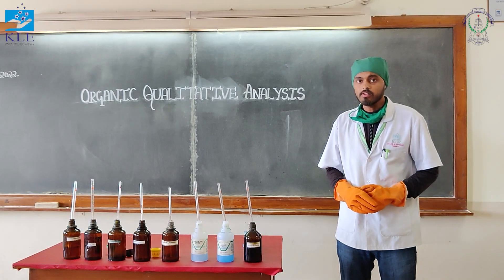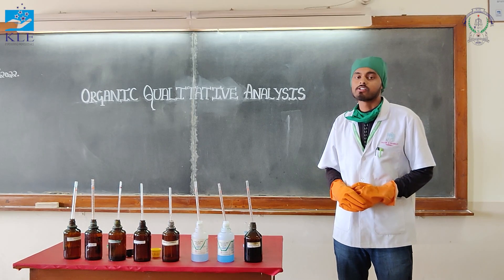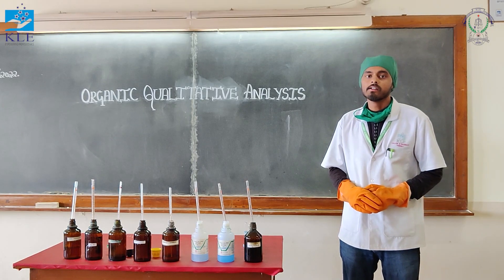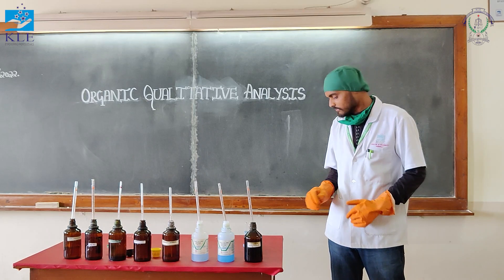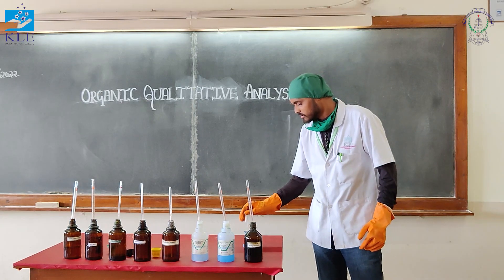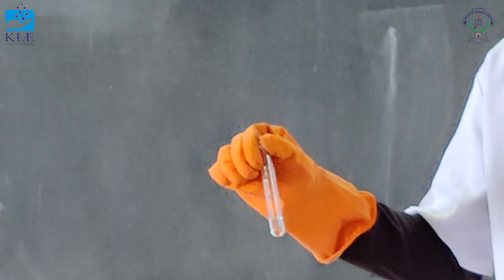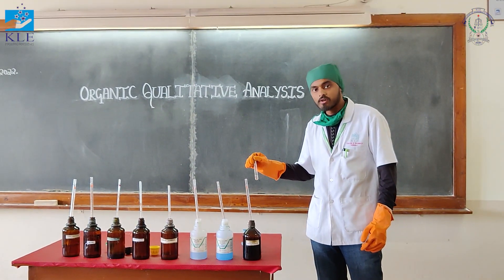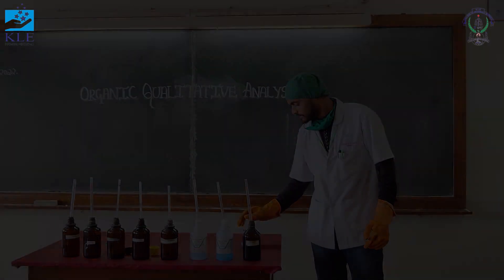The next test is for halogen. Take the stock solution and add HNO₃ and AgNO₃. There is no precipitate. Therefore, halogen is absent.